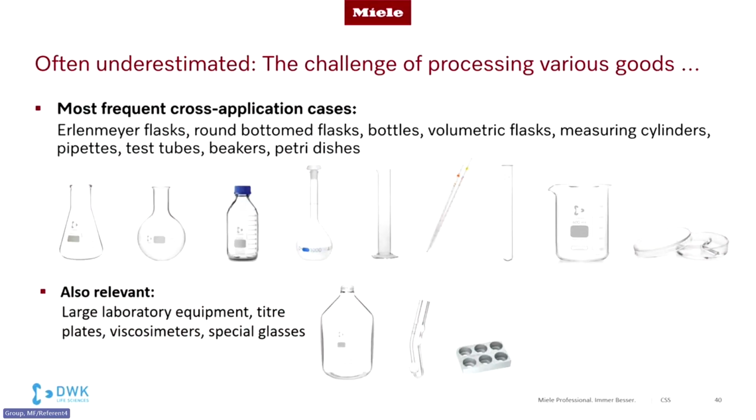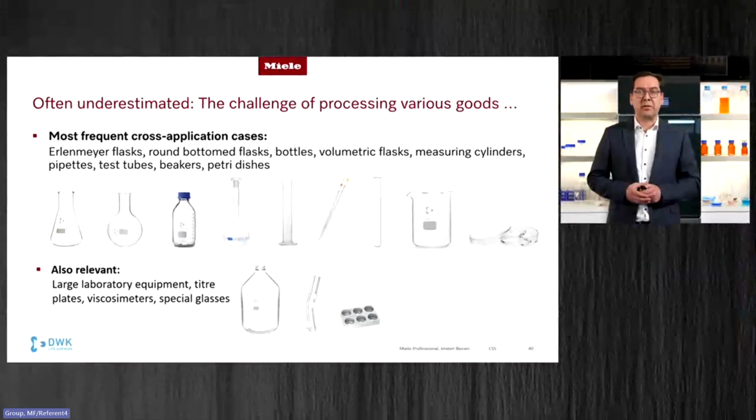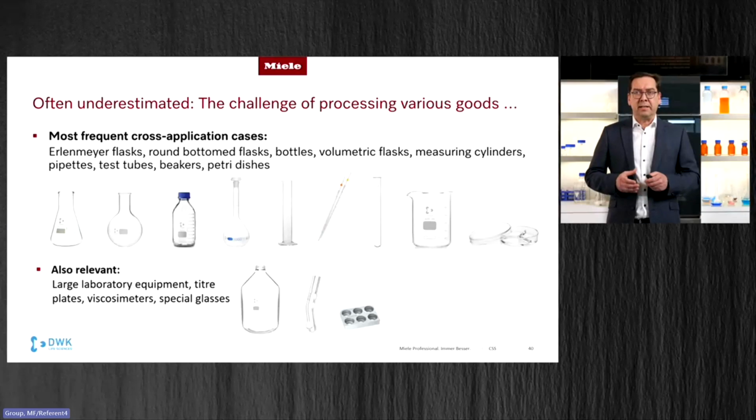So, cleaning laboratory glassware is a challenge, and why is that? On the one hand, you want to achieve a thorough cleaning. That's pretty clear. But on the other side, you also want to be as gentle as possible to your lab glassware items, to preserve and retain their value, as these products are very expensive. And it's a kind of challenge, as you have to consider that you have a lot of different types of lab glassware items that need to be processed, sometimes in the same batch in a laboratory washer.